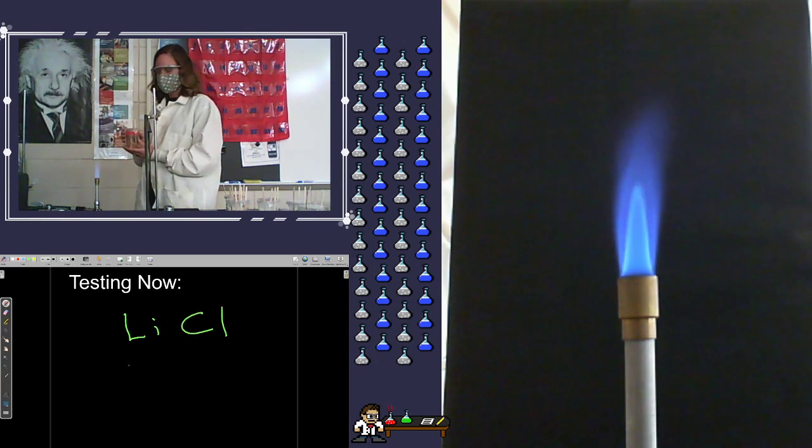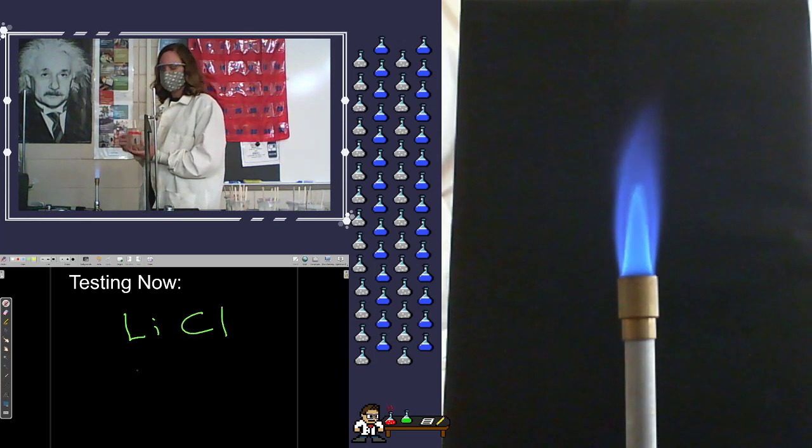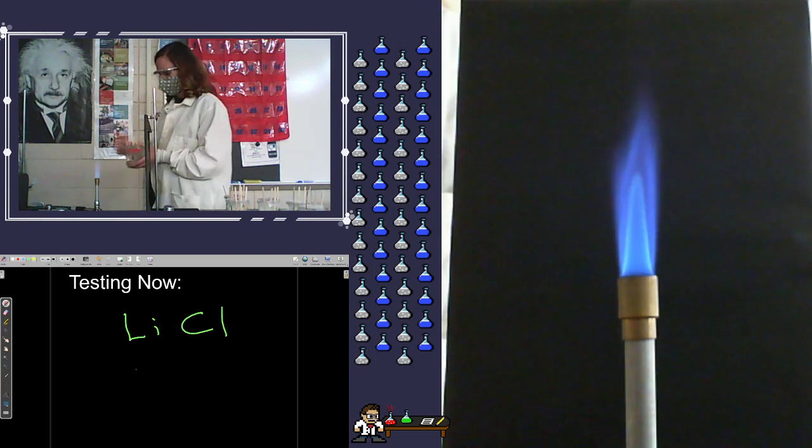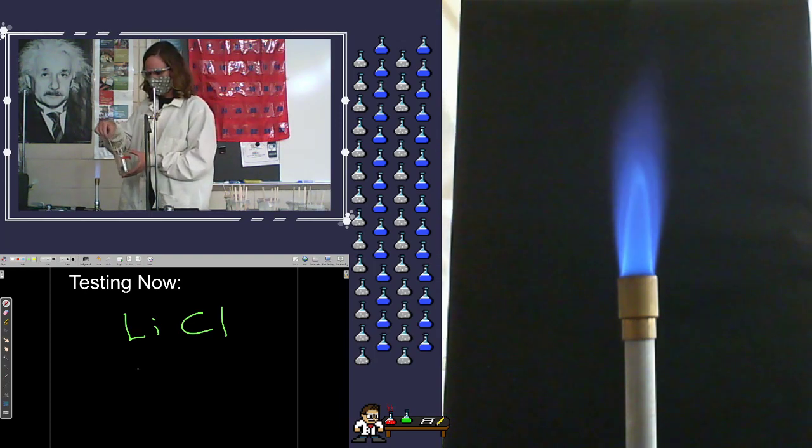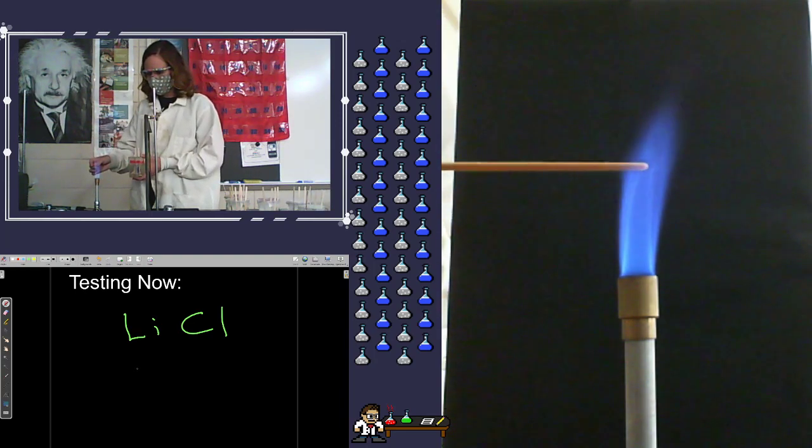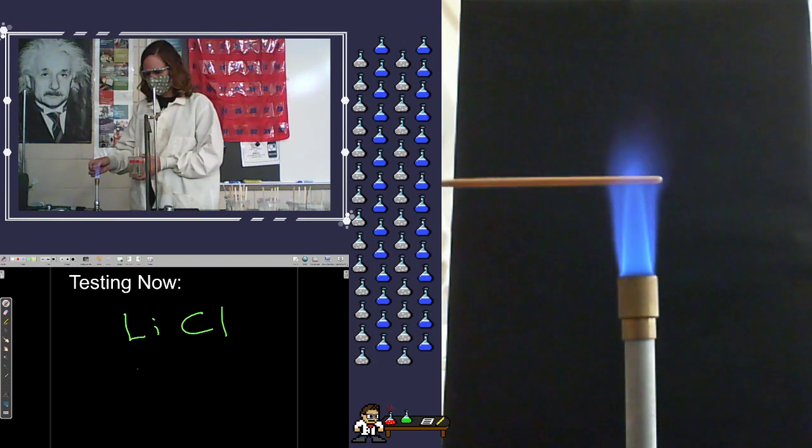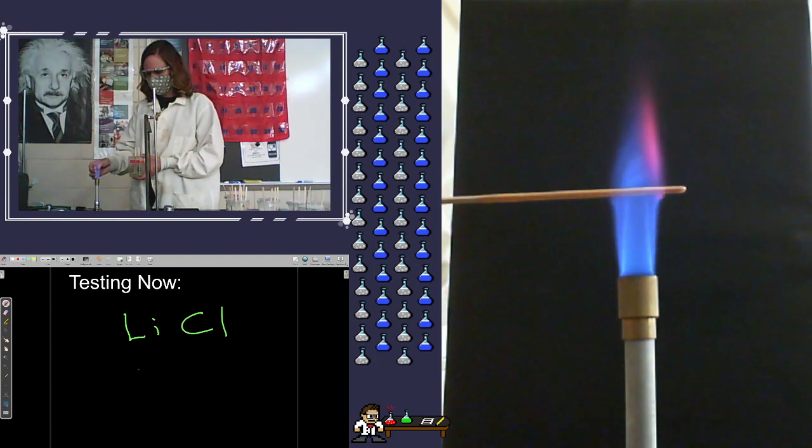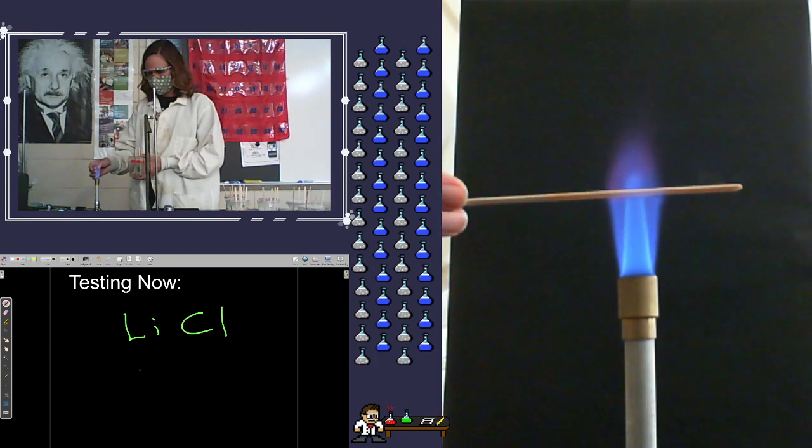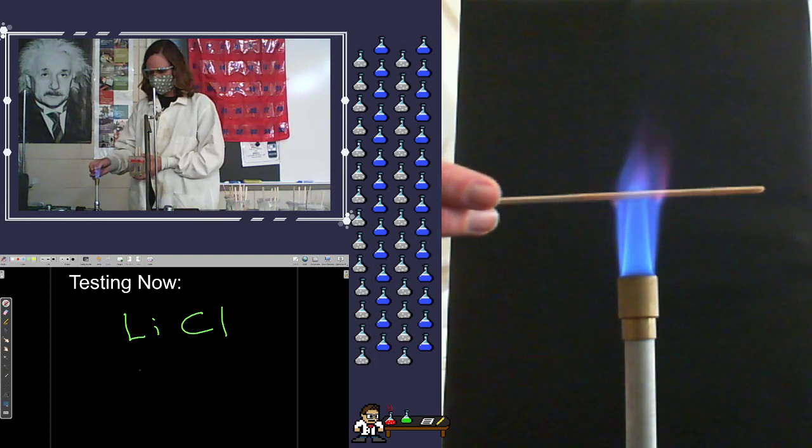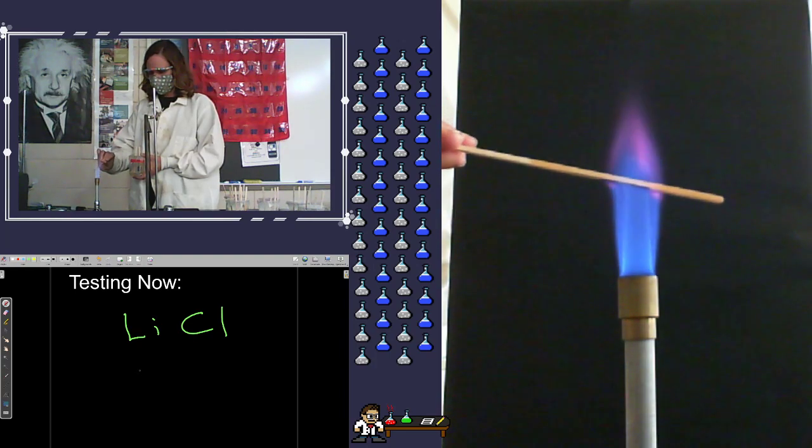So our next one is lithium chloride. I think this is possibly my second favorite. I love this one a lot. There we go.